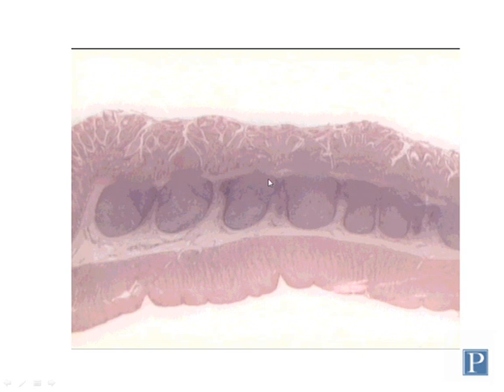So take a look at this Peyer's patch structure in your particular slide. You'll need to use the slide that actually says Peyer's patch, where that region of the ileum has been dissected out. There are other slides that show parts of the wall of the ileum that may not have Peyer's patch in it. So make sure you're looking at the correct slide.